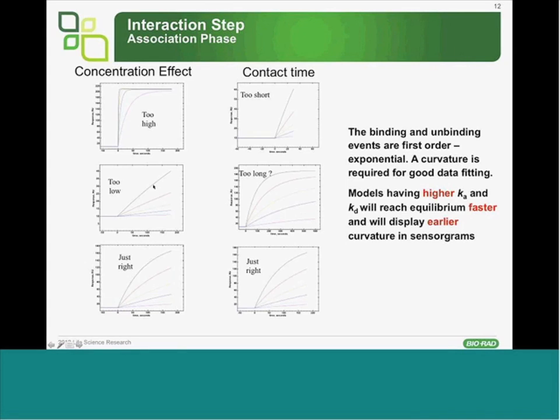These are used at the end of the injection, because we don't run it all the way, since very often running it all the way will be very long and one gets more non-specific binding. So one wants to do a relatively short step of analyte binding and then dissociation, but one wants the right concentration to get good curvature, and this here is the right concentration, as you can see in both cases, and also the right time frame.